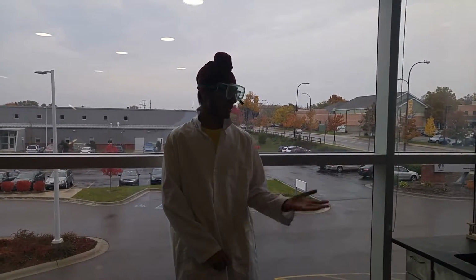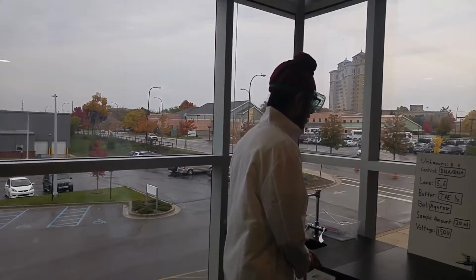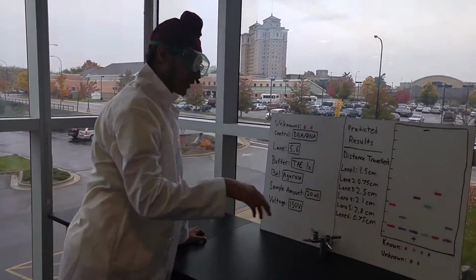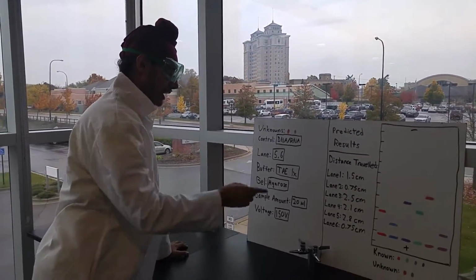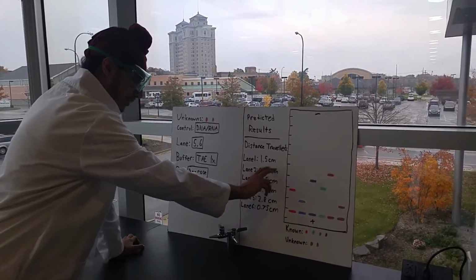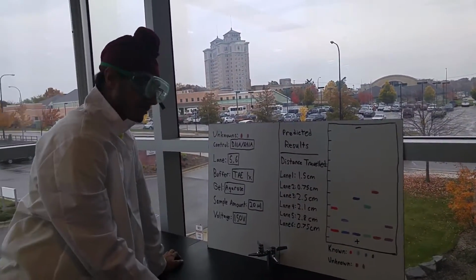Hello, I'm Dr. McNasty's lab partner, Dr. Pepper. Here, you can see the display for our revolutionary app. Over here you can see the information that you input when you put in all the information for the different samples. And after you run the simulation, you'll get a screen that looks like this, that has a simulation of the gel itself with the negative and the positive electrodes.